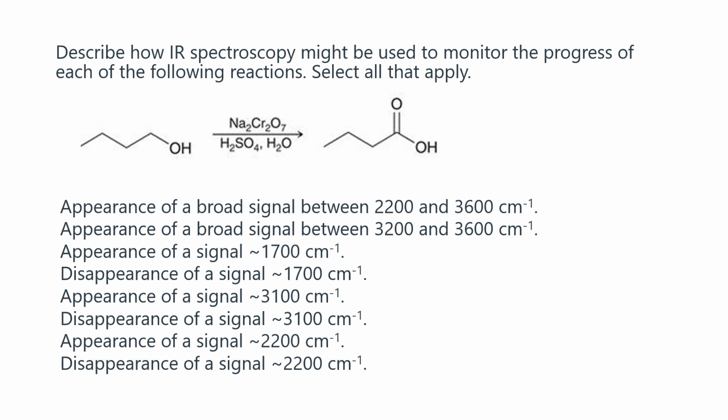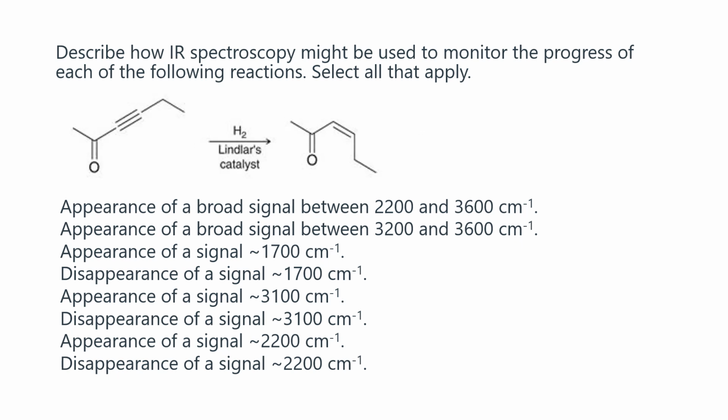Here, that's another oxidation. Oh, I think I repeated the same slide. Okay, moving on. So what do I have here? Carbonyl, so that's not moving, right? Lindlar's catalyst, this is to do a partial reduction of the alkyne, and it produces the cis alkene from the alkyne. So you're adding two H's. What you should see is that the band of the alkyne disappears and the alkene appears.